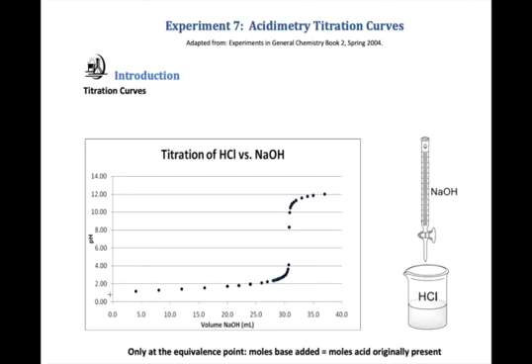On the diagram, we can see how the pH depends on the amount of sodium hydroxide that we've added. Notice that the starting pH is something around 1. That would mean for our strong acid that the concentration has to be quite close to 0.1 molar, which would be the concentration that we want to know more accurately. As we add sodium hydroxide to the solution, notice that the pH doesn't change very rapidly. We can add 4 mLs at a time, and we see very little change in the pH until we've nearly reacted all the acid.